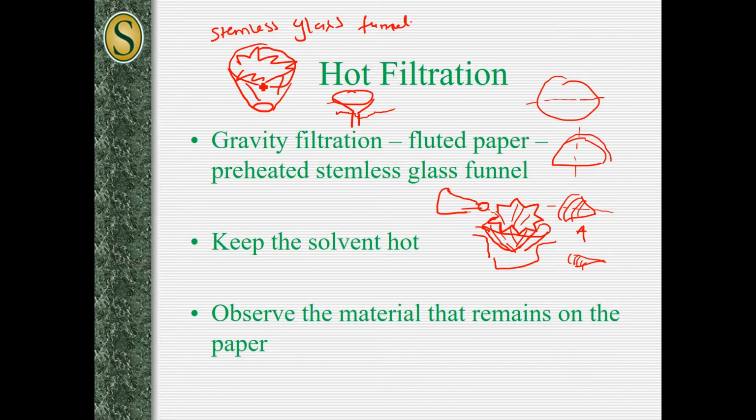I told you it's creased to increase the surface area for solution flow. As you pour the solution, you want it to quickly go down, because if it delays, you're going to have premature cooling of benzoic acid. I told you benzoic acid does not dissolve in cold water, so you want to keep it as hot as possible. Once you pour it, it's going to drain down into a collecting beaker, right? In fact, you should be seeing some crystals forming already.